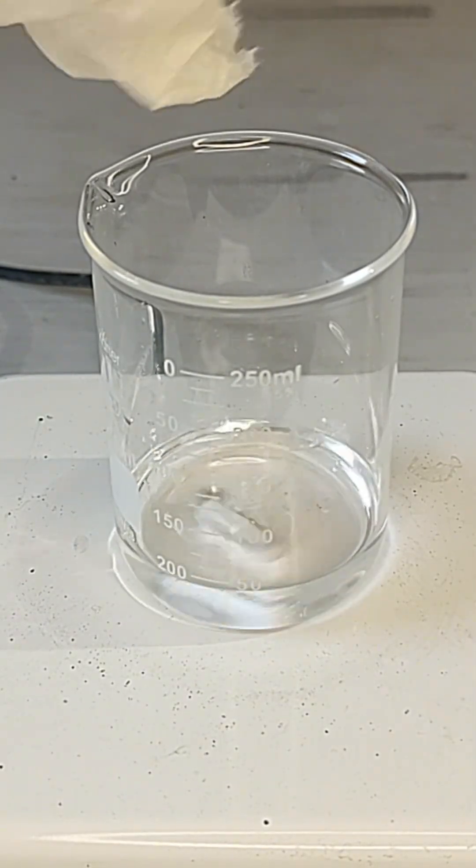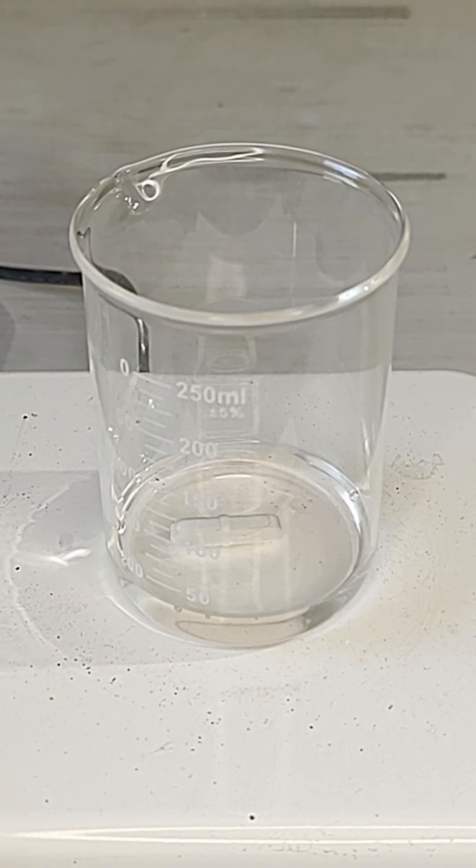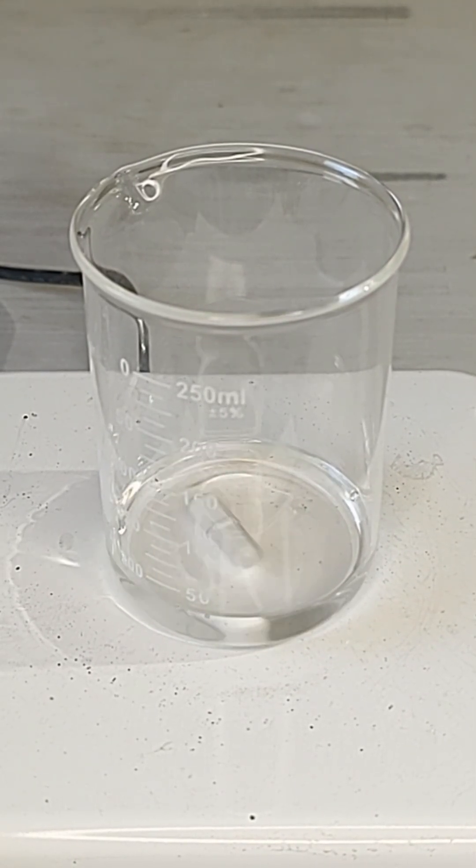This paper towel really pisses me off for some reason, so let's destroy it. To start, I added 30 milliliters of 98% sulfuric acid into a beaker and turned on the stirring.